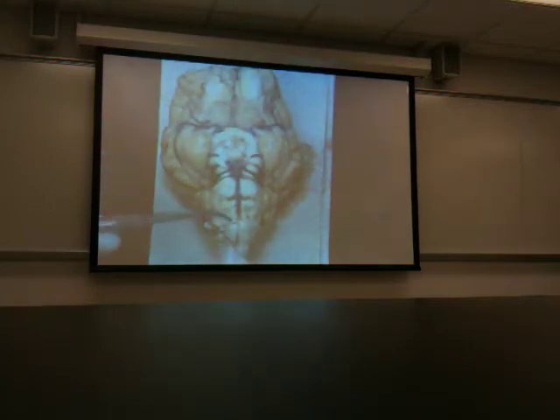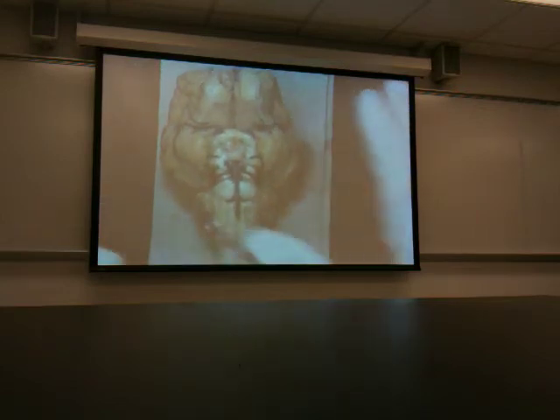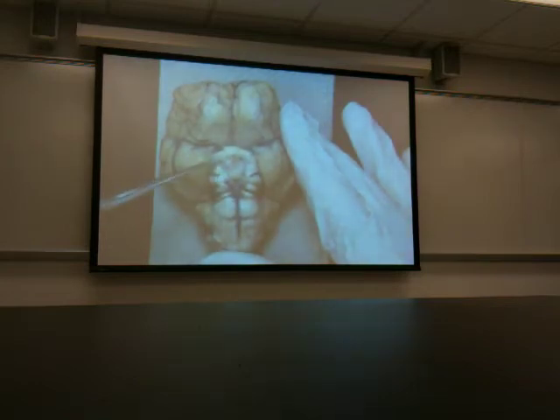This one is blood-filled, so you can see it quite well. This is the basilar artery here. These are the posterior cerebral arteries there. Now, it's empty. There's not blood up in here. And literally, the division between the posterior cerebral arteries and the anterior cerebral arteries is right in here where the internal carotid artery, and actually I think it's ripped out, but I do have one that's intact. Internal carotid artery comes in right about here, just behind the optic tract.